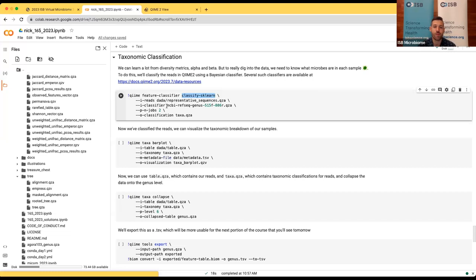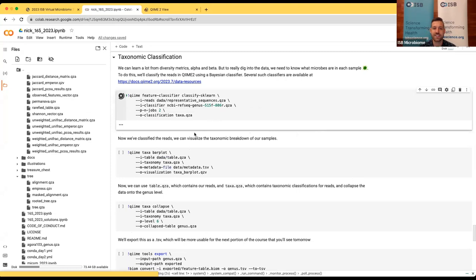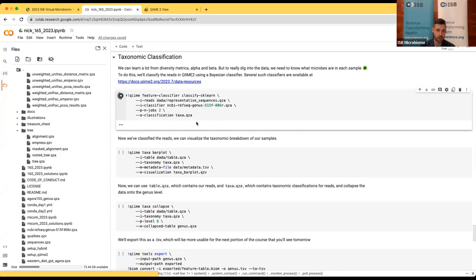This classifier is collapsed to the genus level, since that's the most granular taxonomic level to which we can confidently assign taxonomy. You'll also see that this classifier was trained specifically on the V4 region of the 16S gene, making it very specific to the data we're working with today and returning more specific results than a classifier trained on the entire 16S gene. We'll assign two CPUs to get this done. As output we'll get a new QIIME artifact called taxa.qza, which will contain all the taxonomic assignments of our ASVs.